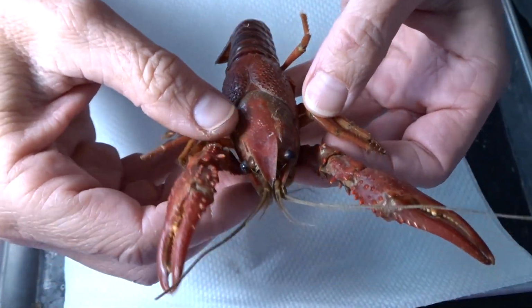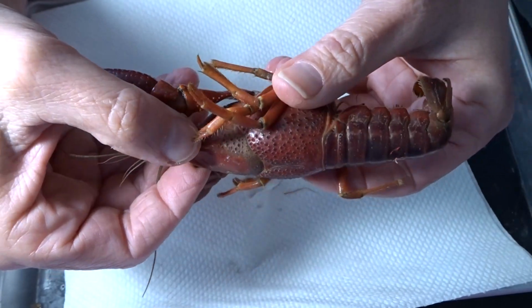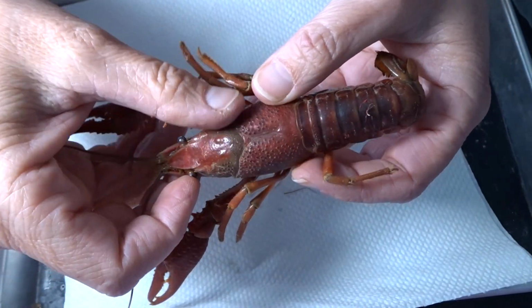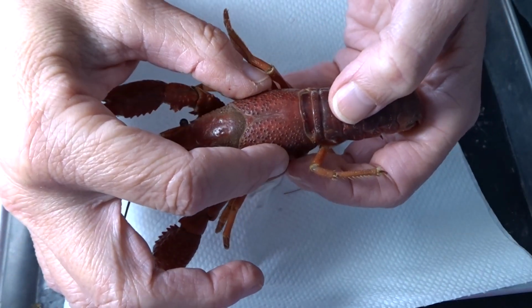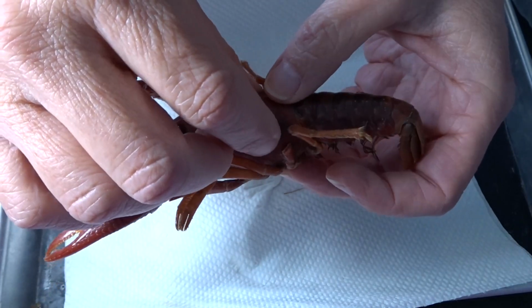All right, so the body region is called the cephalothorax, right? Cephalo means head. Thorax, I want you to think of the thoracic cavity, right? Right where our lungs are found. Well, it's also in this cavity, right? This is where all of the important organs are going to be located in the crayfish. But I want you to be able to see, so we're going to show something.